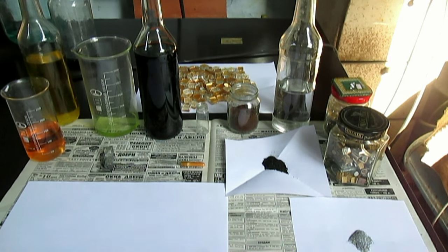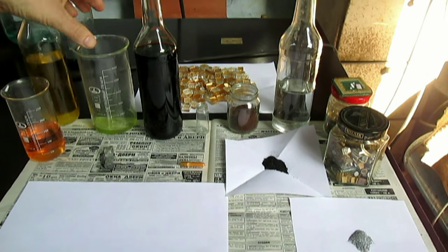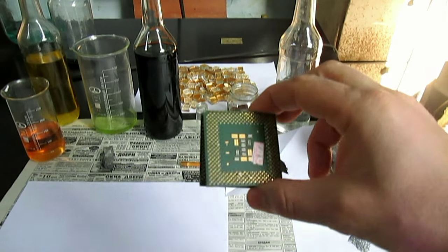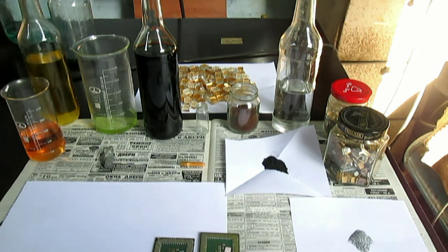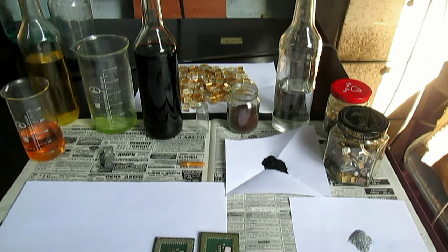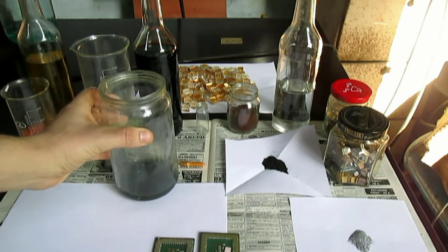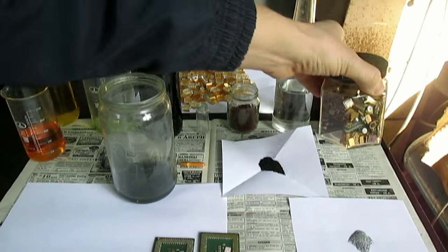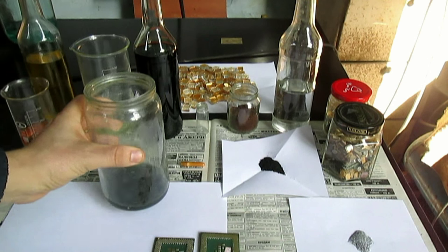Мне сейчас понадобится стаканчик. Я хочу протравить два процессора для этого видео — я всё это растворю в азотной кислоте. Осадок с золотом, который мне Сергей передал, — я об этом буду показывать после этой трилогии, когда буду перерабатывать вот эти радиодетали. А заодно и этот осадок. Осадок грязный, я его потом растворю.